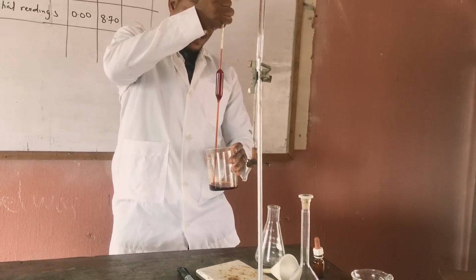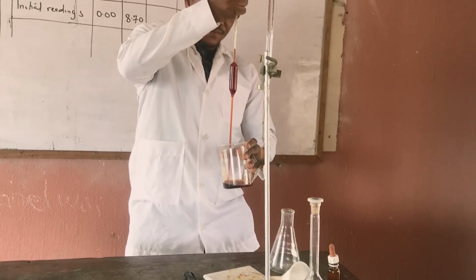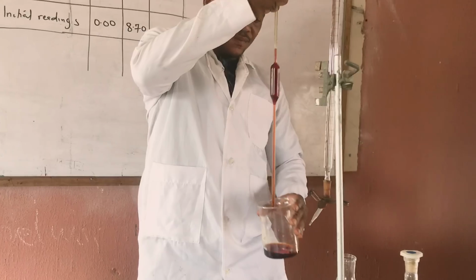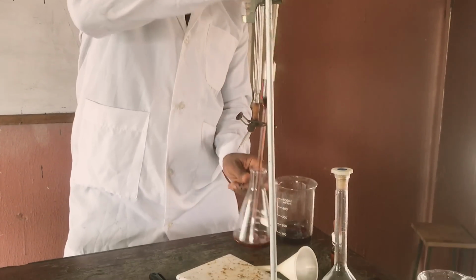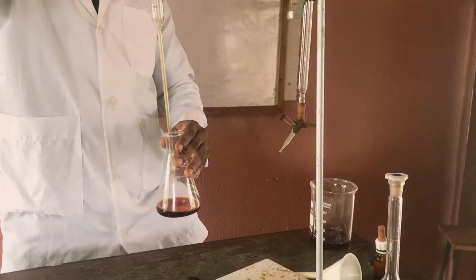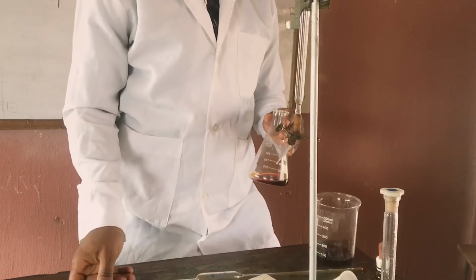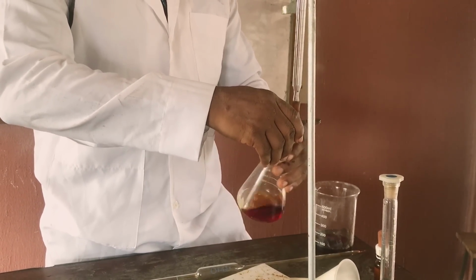Another 25 centimeter cube of iodine. Okay. Running into my conical flask while I begin titration. Okay, let's see again. That's another one. Let's see how it goes.